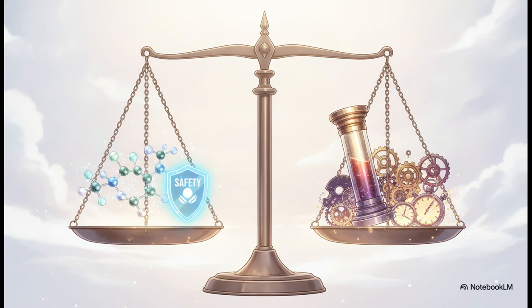But we've got to acknowledge the limitations. Chiral columns are notoriously expensive, and they don't last forever. Plus, since every single separation is a unique puzzle, finding the exact right combination of CSP and mobile phase takes extensive method development time, which obviously drives up operational costs.